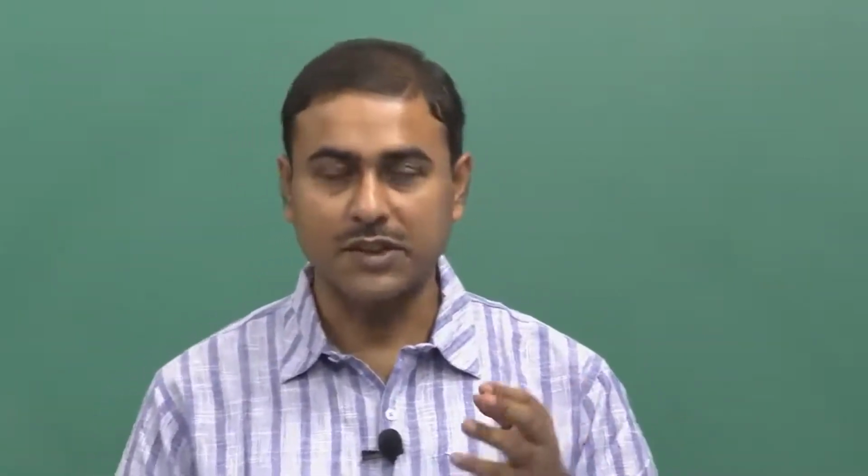we have to proceed to the most important part of single molecule spectroscopy. How is it possible to see a single molecule? It is not easy. So, let me point out a few important parameters which should be improved to observe the fluorescence from a single molecule.